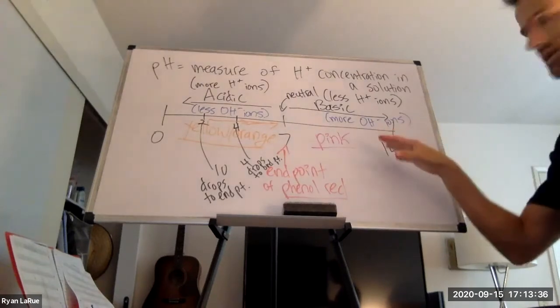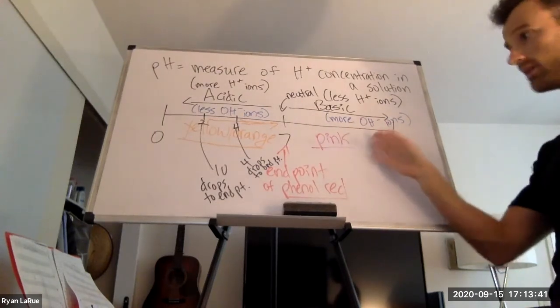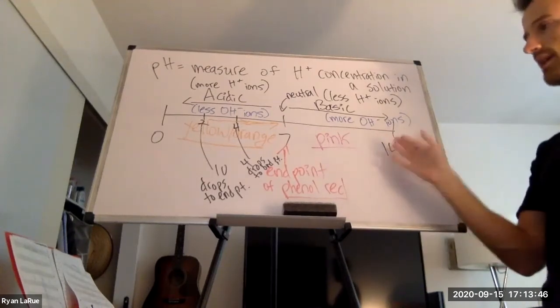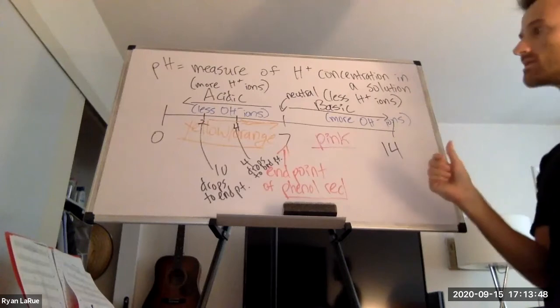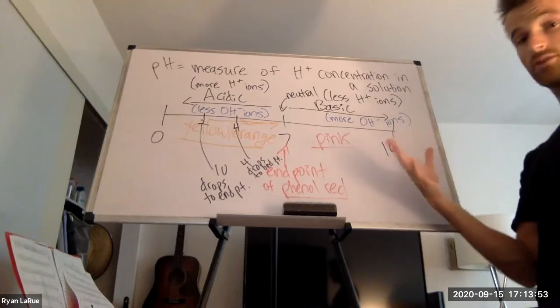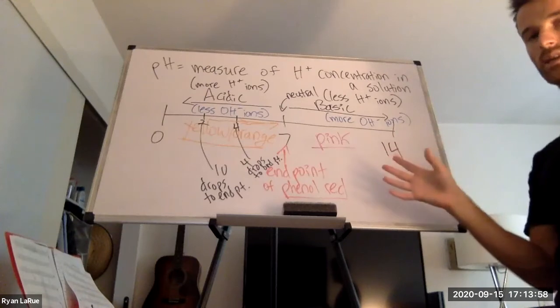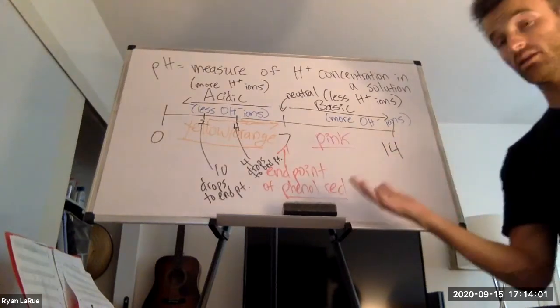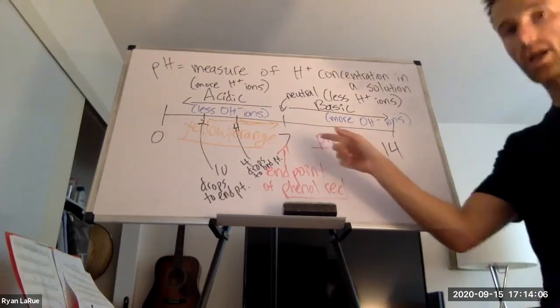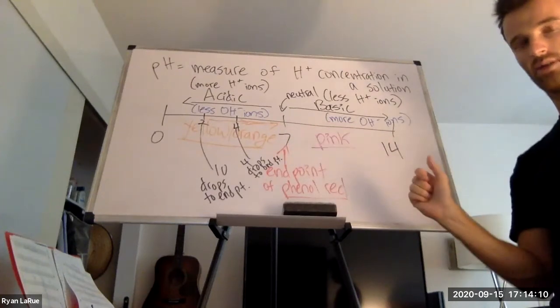And it's vice versa. If you have a pink solution, you know it's basic. You know it has a higher pH, less hydrogen ions. Let's say it's pH 10 or 12 or whatever. To determine how basic it is and what the pH is, 10 or 12 or 9, you'd count the amount of drops of what? What's going to lower the pH back to 7, to that endpoint?